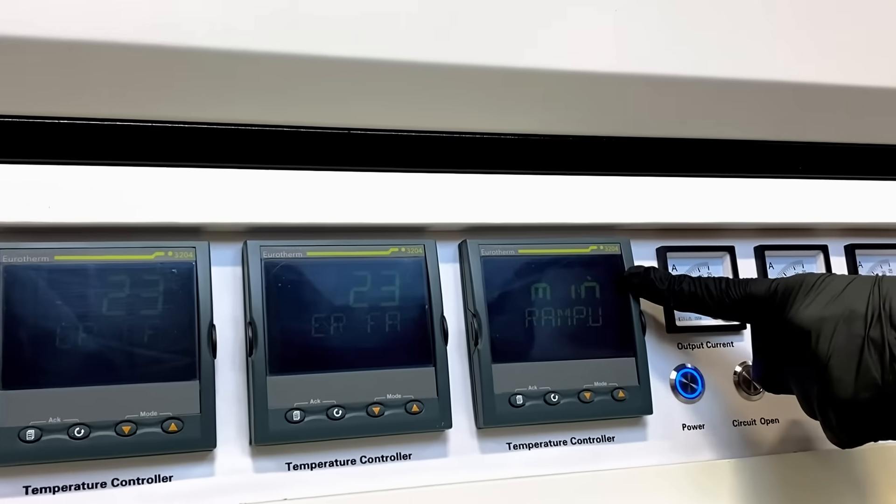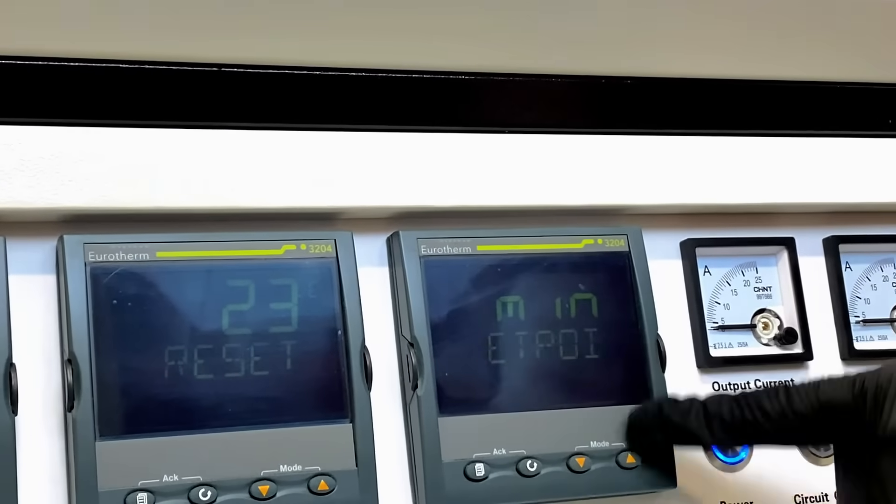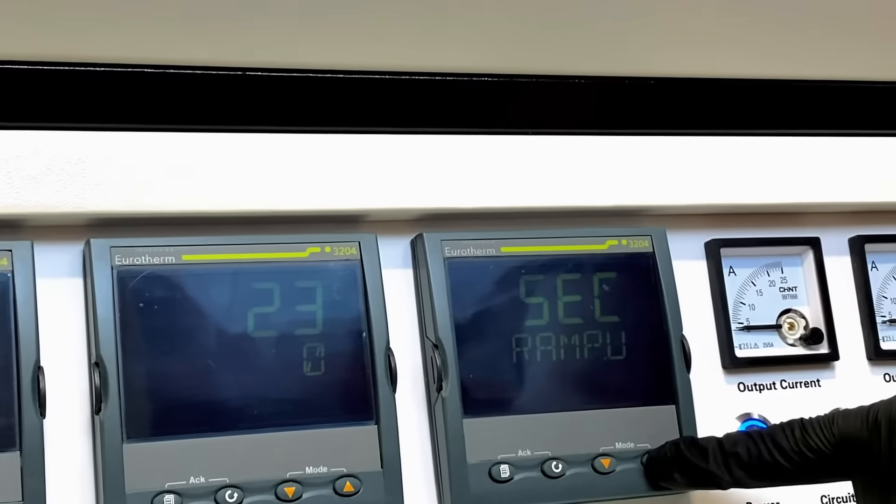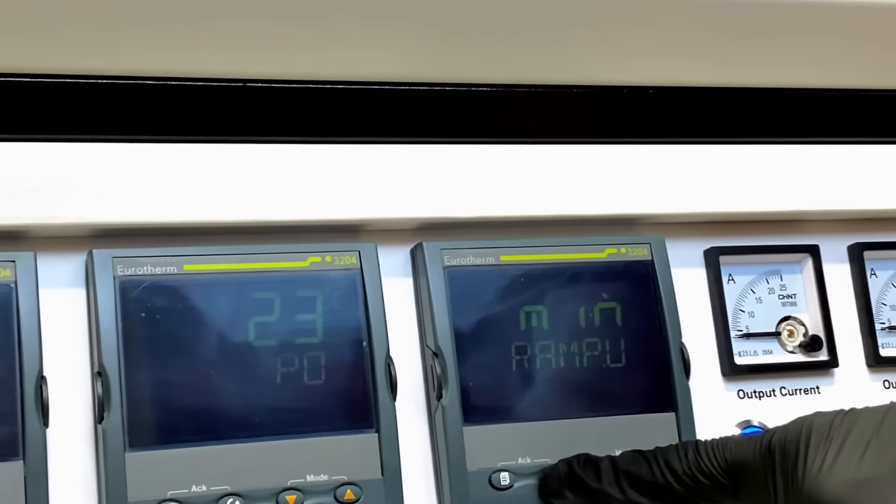This will select the unit of time in which we are going to program our ramp rate or our heating rate to our target temperature. You may select between hours, seconds, and minutes. We're going to select minutes and press the cycle button again.